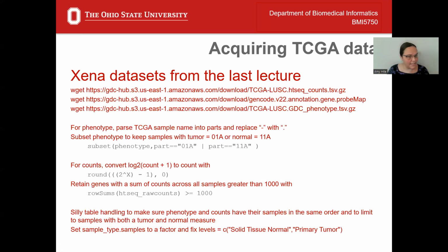We have to process it a little bit. And I always say getting the data tables into the setup usable by the differential expression programs is actually the hardest part. We have to take these sample names, cut them up, and pull out certain parts. So we have some pre-processing to do, and I'll go through that when I'm going through the script in the next lecture. But there are a few steps that we have to do to pre-process this data.